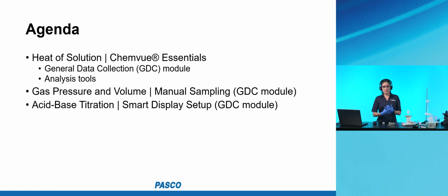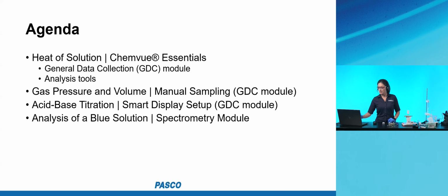If you're familiar with SparkView or Capstone, you're familiar with how quickly you can get to data collection. But I believe that Chemvue will get you there even quicker because of the smart display features.